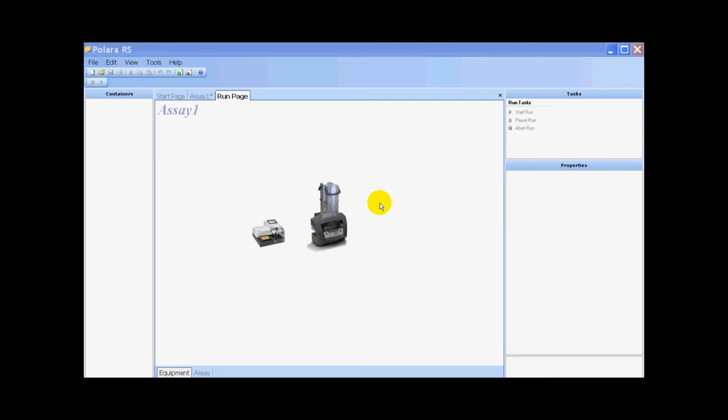Next, we just select the Restack button on our Start Assay Run pop-up, and we hit Start Now. In the background, you'll hear the RapidStak homing and establishing communication with the HydroSpeed. Shortly on the screen, you'll see a real-time status of operations as they happen on the equipment.